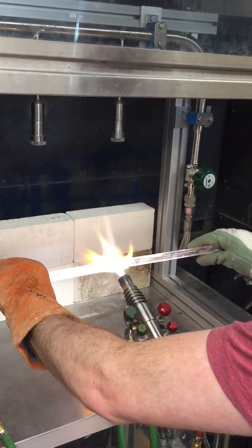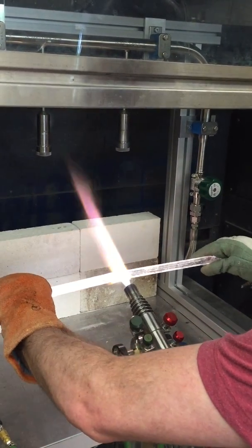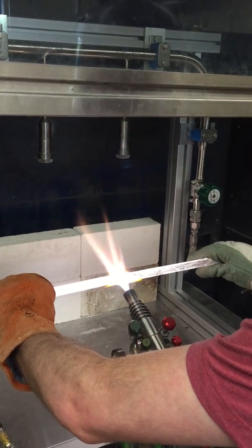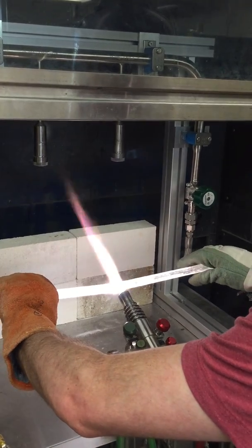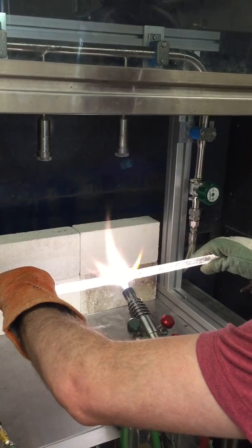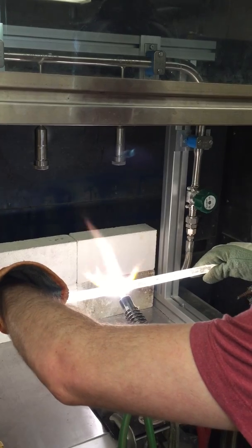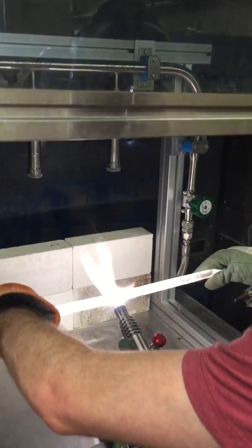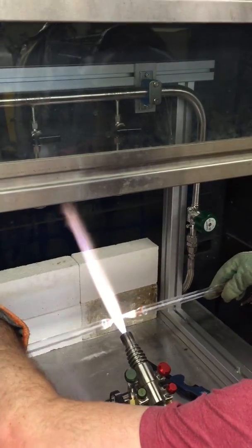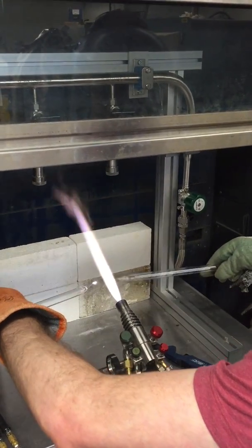You see it start to turn like white, yellow. You see how it bends a little bit? Keep it moving. And pull outward. When it gets thin, you can just push it through the flame like that and you can dull the ends a little bit like that.